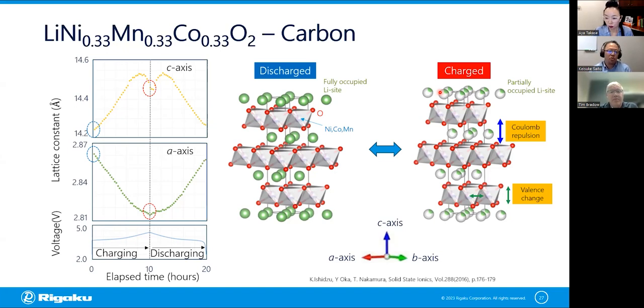I see. So if you believe your amorphous material becomes crystallized, that means crystalline materials appear during this operando procedure, I would recommend this kind of operando measurement, right? And operando measurement may tell you at which point during charging or discharging your material became a crystalline structure. This could be an interesting observation for you, I believe. So if so, it's worth trying the operando XRD measurement.